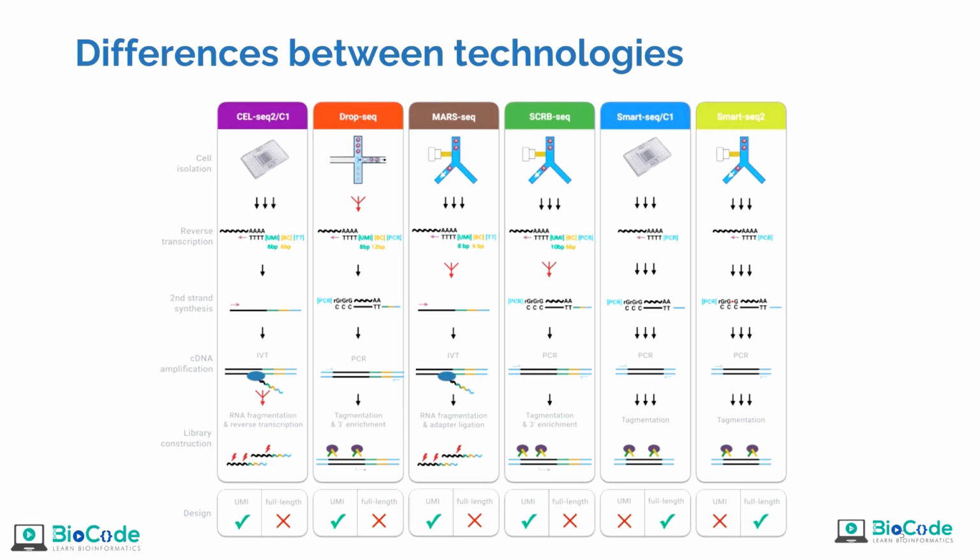For example, we had one fragment, we will now amplify it 100 times so that we have more depth in our sequencing data, so that the sequencing procedures are proper. We remove these overly duplicated reads later on, and this is where UMIs and cellular barcodes help us to identify technical duplicates that we have created ourselves using PCR, or the original duplicates that might be possible due to overexpression of a particular gene. After this, tagmentation and 3' enrichment and other procedures are done to do library construction.